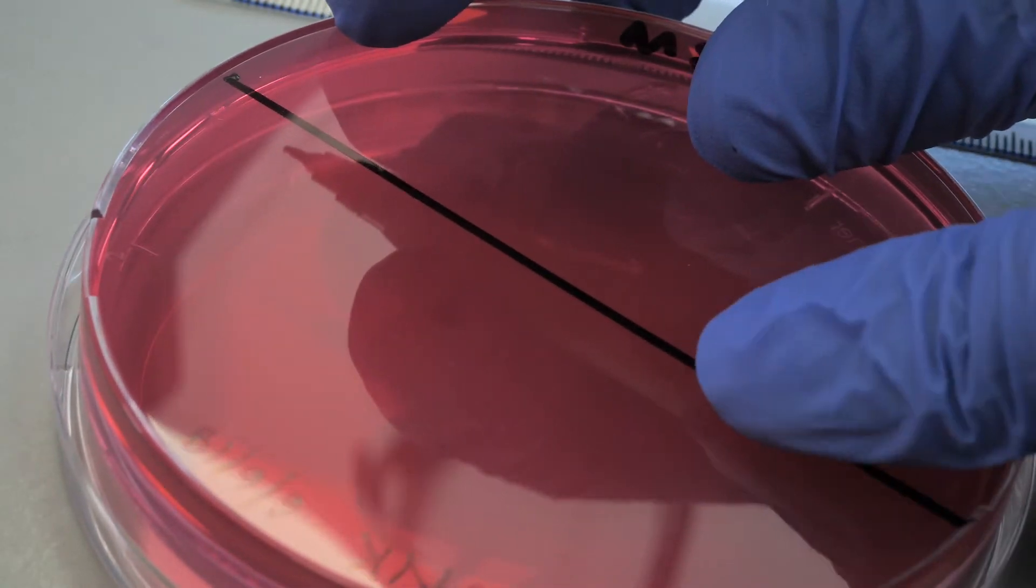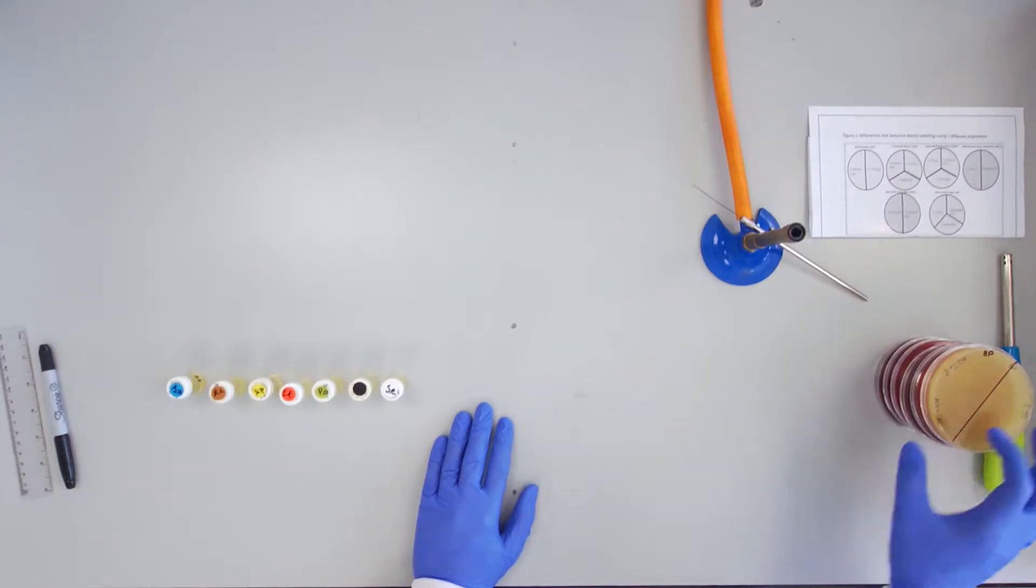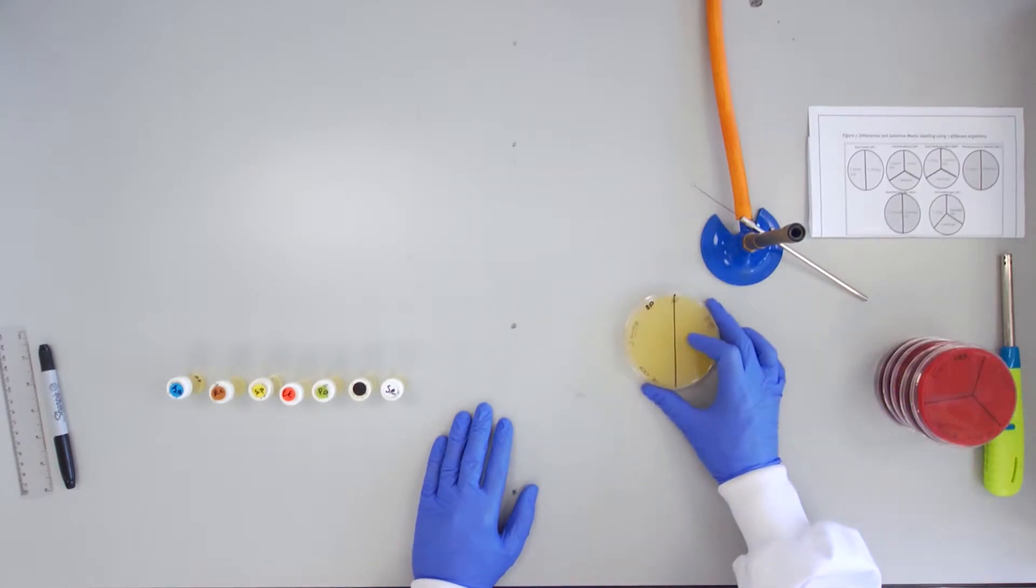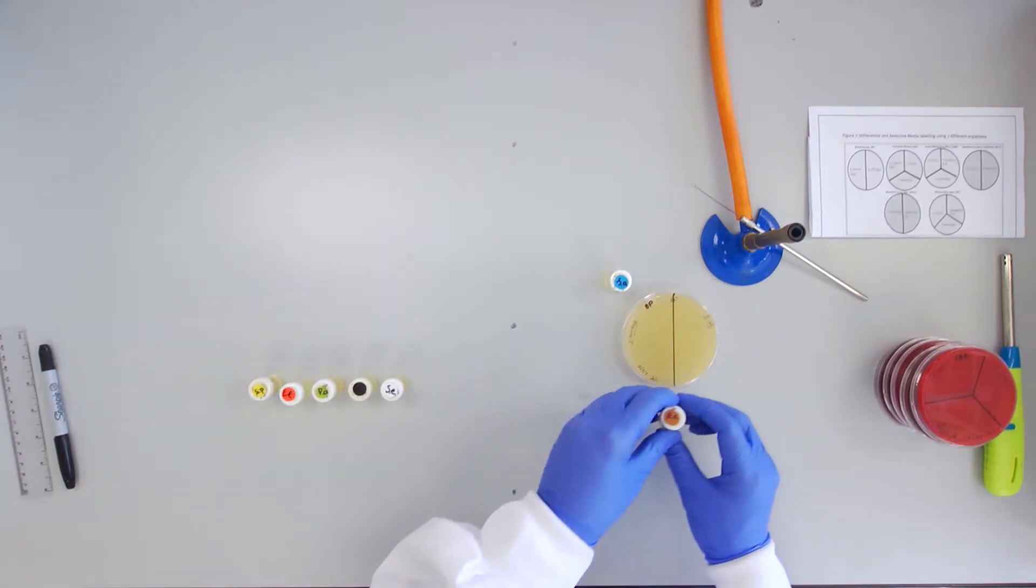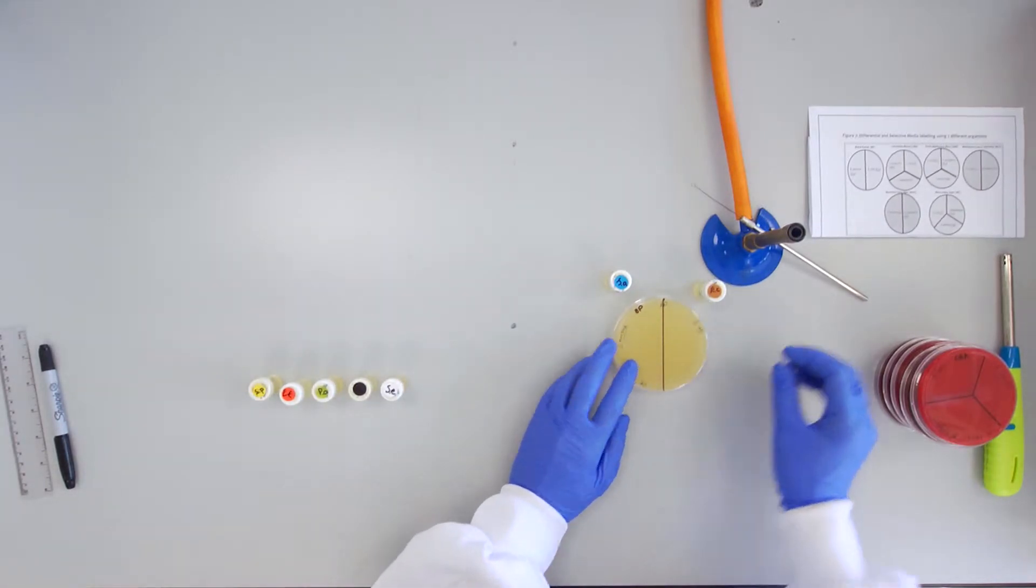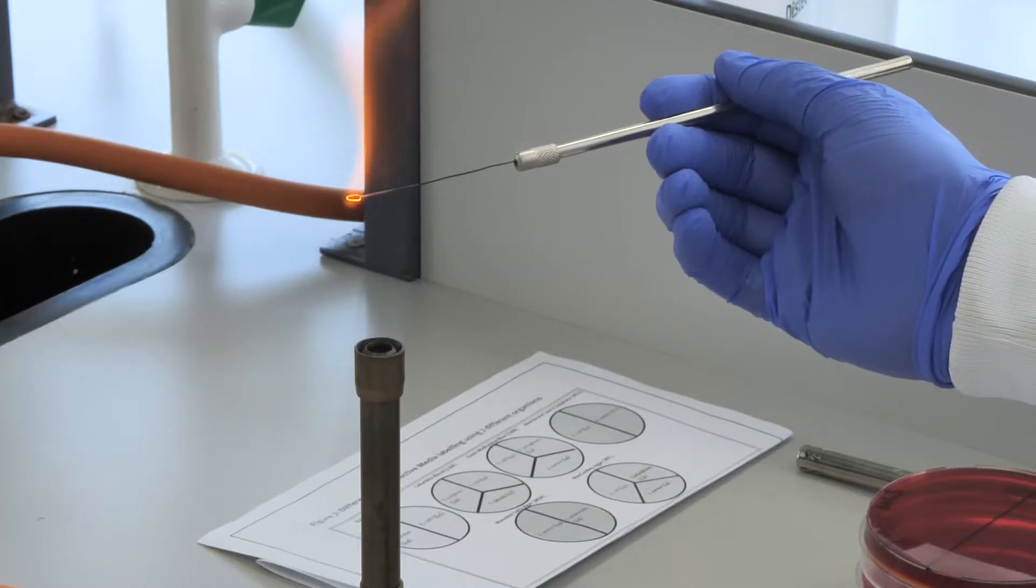The cultures are provided as an overnight broth. The Baird Parker or BP medium is pale yellowish and opaque and will be inoculated with Staphylococcus aureus and E. coli.